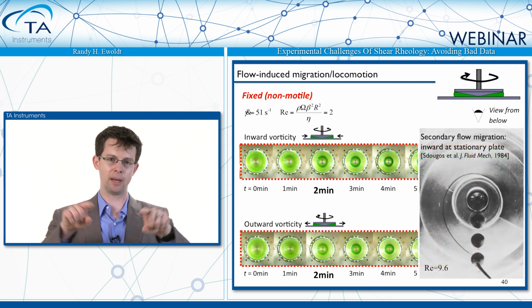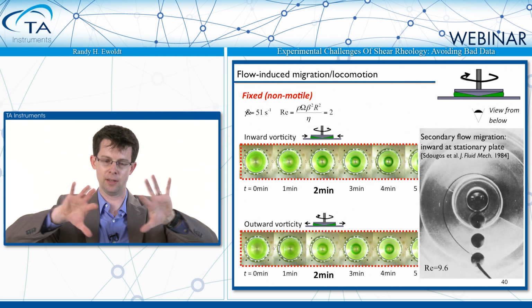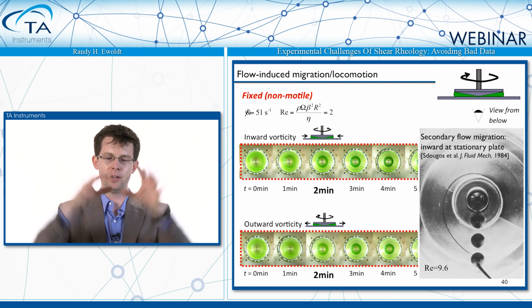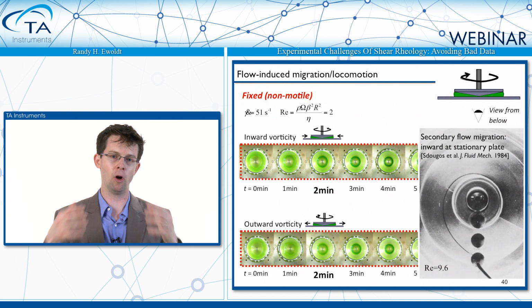And the secondary flows I mentioned are a toroidal flow that are going outward on the moving boundary. The rotating boundary kind of throws fluid outward that then comes back in near the fixed boundary. Our fixed boundary is at the bottom, so these particles that are settling down lower feel this velocity field that also has this inward component that's collecting them all near the center.